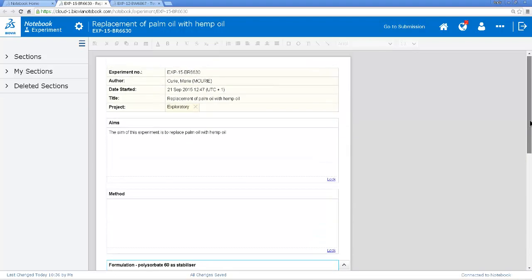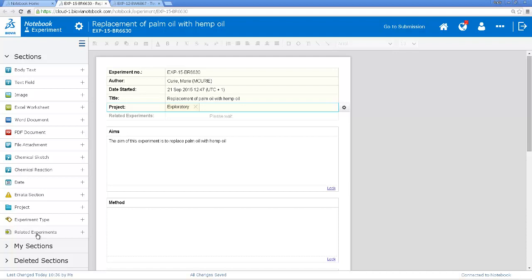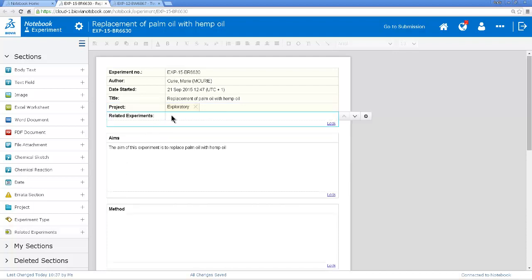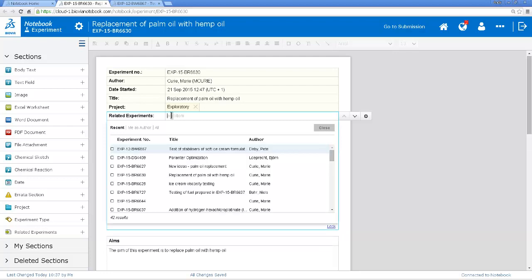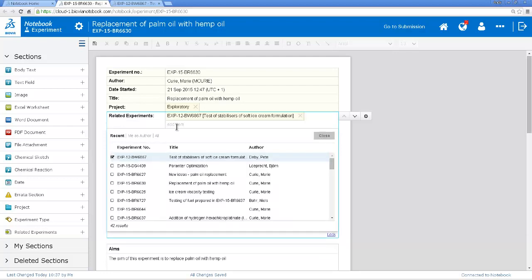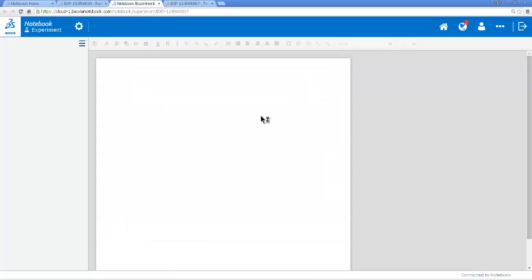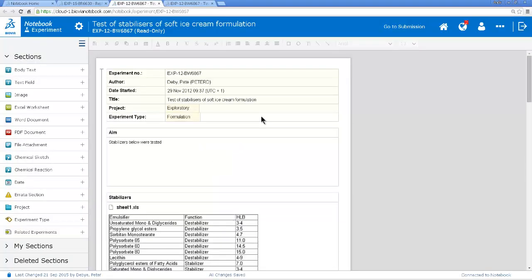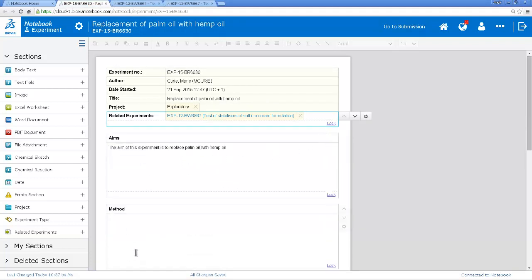What I might want to do is link this experiment back to the experiment where I've just taken that formulation from. And I can do that by adding a related experiment section here in the section toolbox. So if I click in here, it will show experiments that I've just been looking at. Here it is. And that adds a link to that other experiment. And I can click on that link and the other experiment opens. So the two experiments are linked to each other. So I go back to my experiment and I keep on adding the additional information.